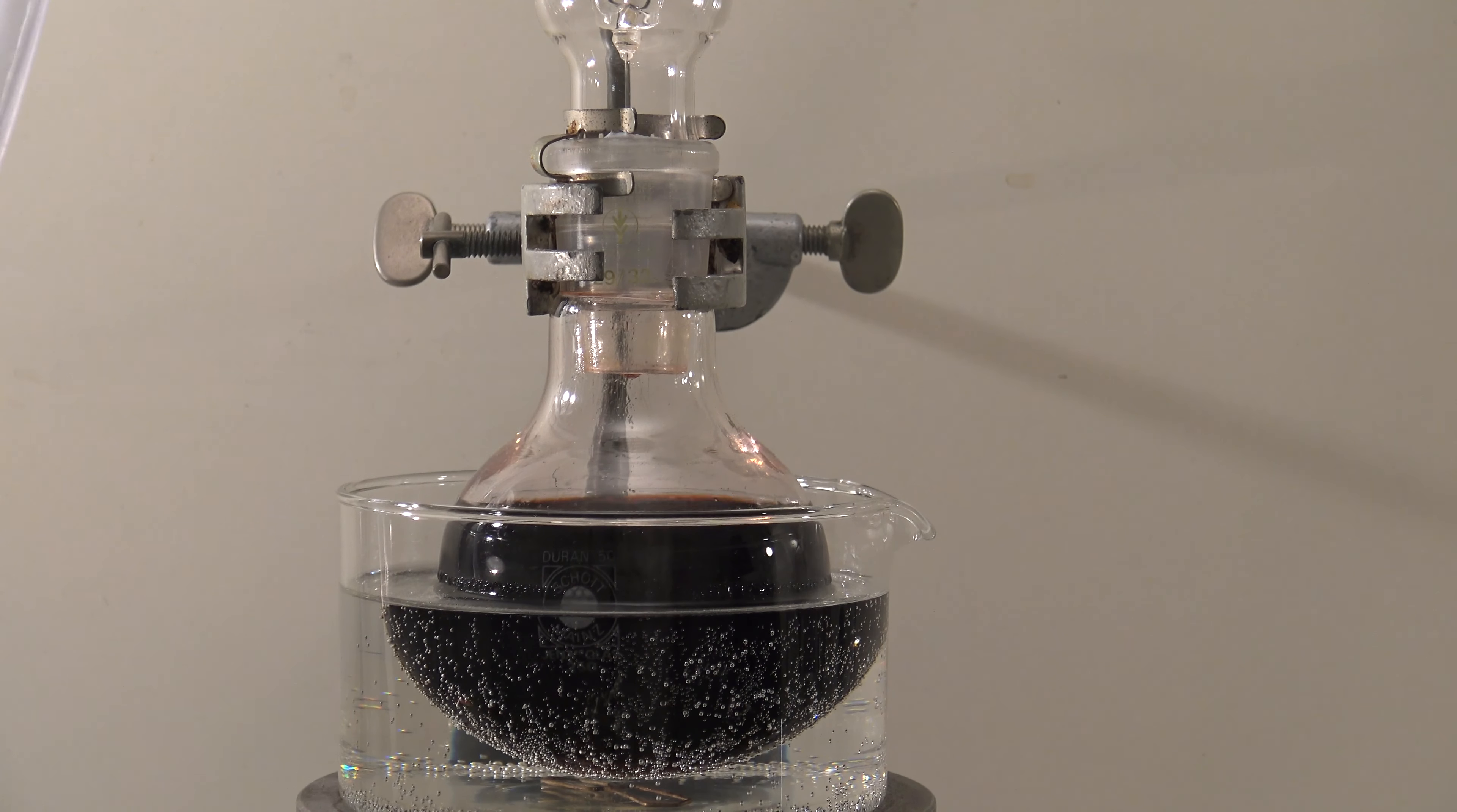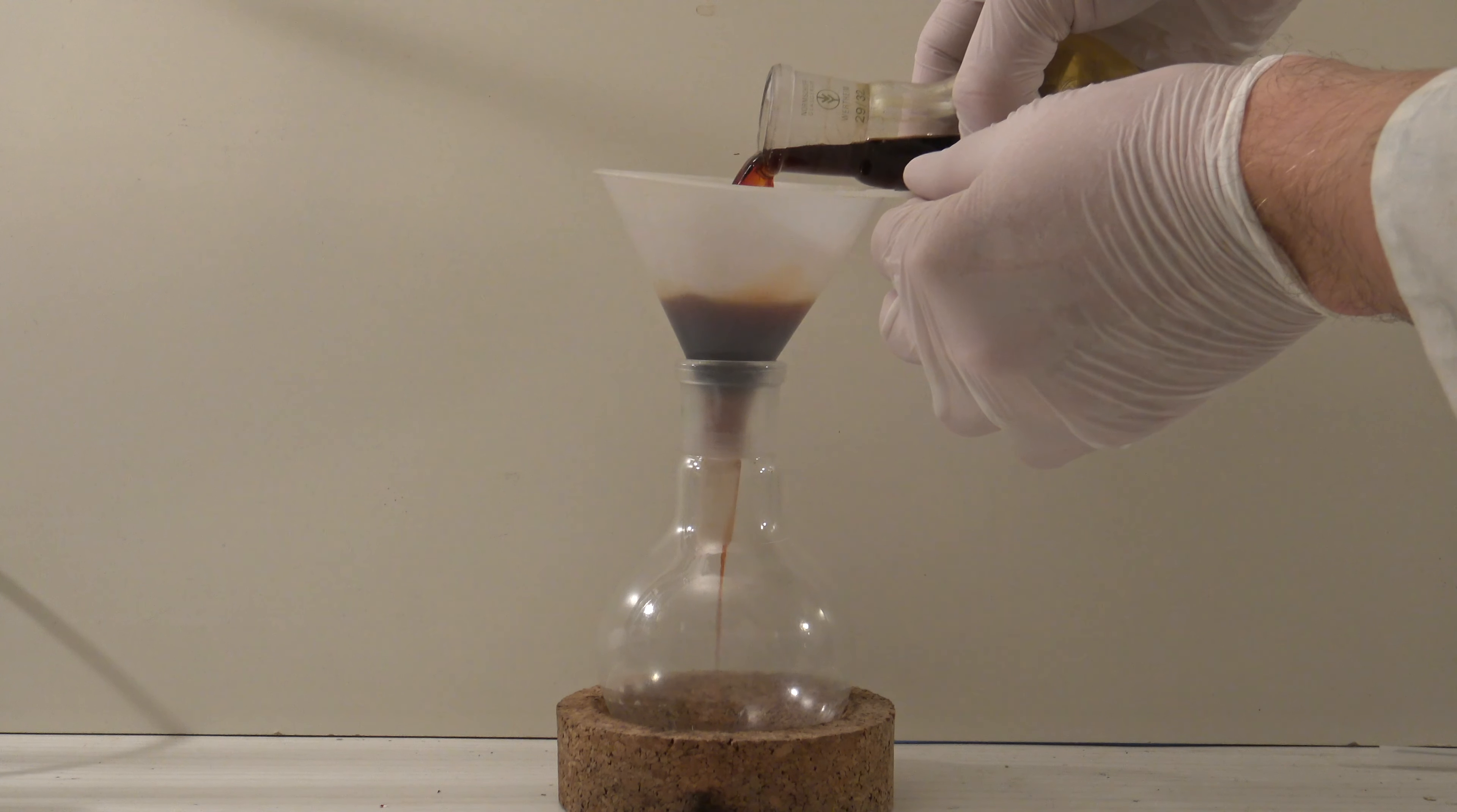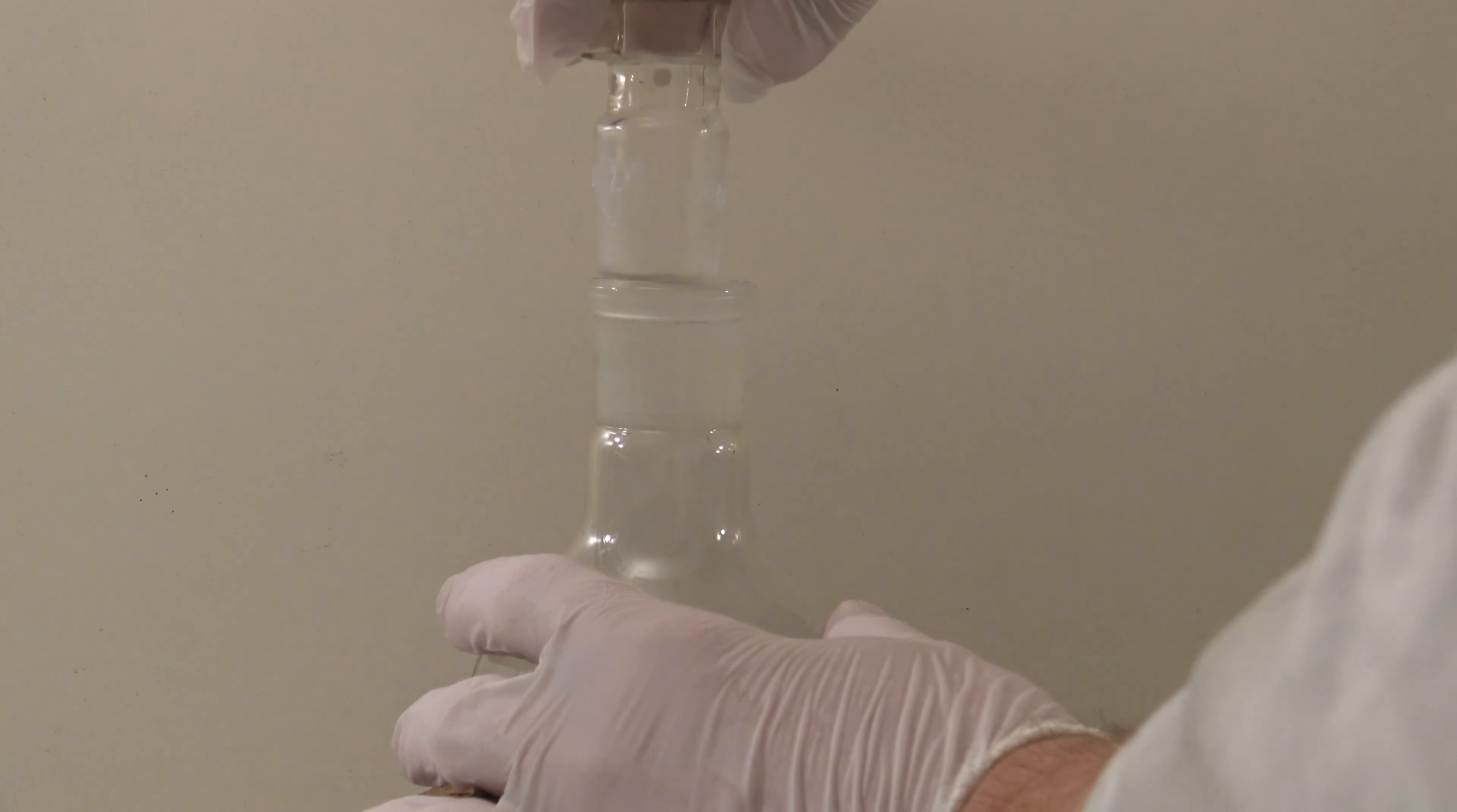But the color of the dichloromethane stayed the same, which was an indicator for the presence of iodine. After 1.5 hours the heating was stopped. A funnel was plugged with cotton wool and the hot solution was added to the funnel. This prevents the crystallization of the product before the residual tin was removed. The solution was left overnight.